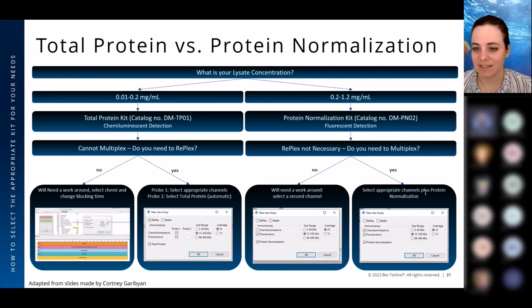Yeah, Phil here. I'm sorry, but if I can jump in with just a couple more insights on that as well. The binding of either the fluorescent or the chemiluminescent reagent is going to be, it's similar. I shouldn't say it's similar, but it's non-stoichiometric. So in other words, if you were doing a Coomassie stain, it will bind differentially to different proteins in the mix. And that's part of the reason why you want to do total protein, because all of those are going to get essentially averaged together. So the numbers that we've got here are not absolute numbers. I would think of them more as guidelines, because different types of lysates or different tissue homogenates or serum or plasma are going to label a little bit differently.